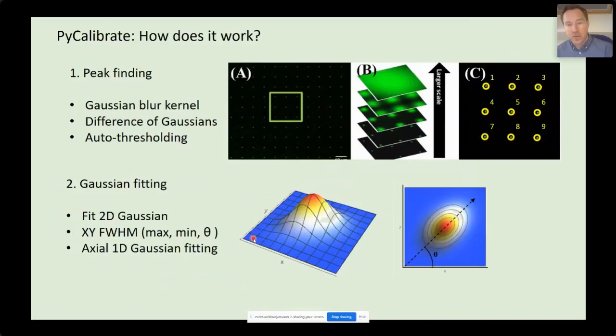And so how does it work? What's the processing behind it? Well, the processing itself is not that original. It's more the implementation. And the implementation is really key here, because that provides the automation. So for a lot of freely available PSF analysis software, we need to enter different parameters into tables, so for example pixel sizes or the NA of a lens.